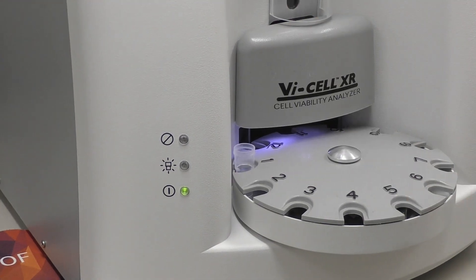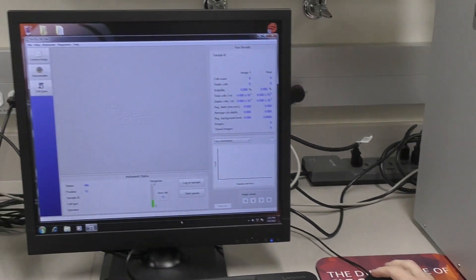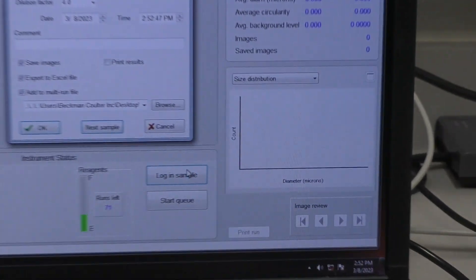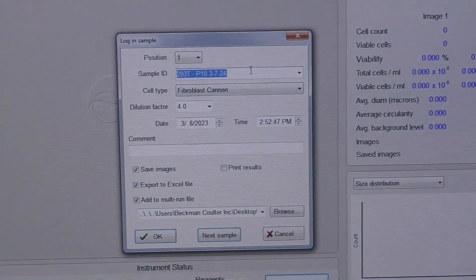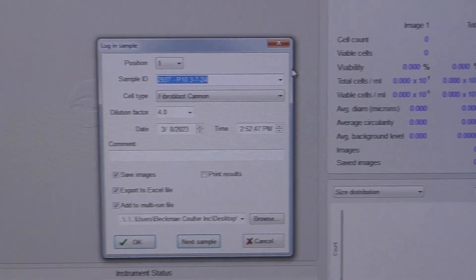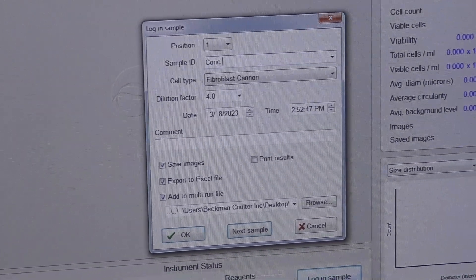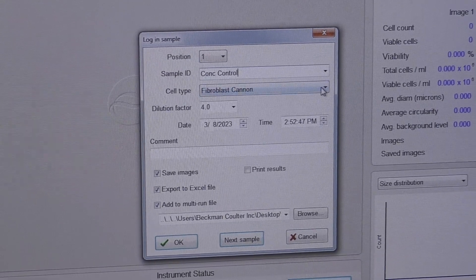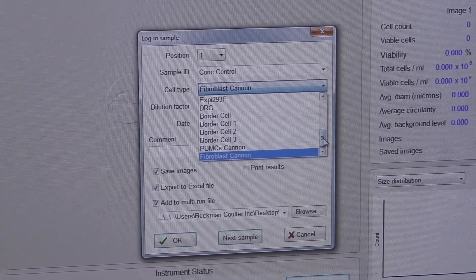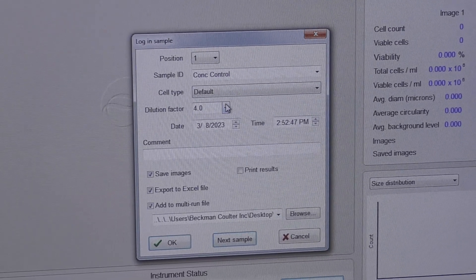You can load up to 12 samples at one time. Go to log in sample, note the position, give it a sample ID, then choose a cell type and a dilution factor.